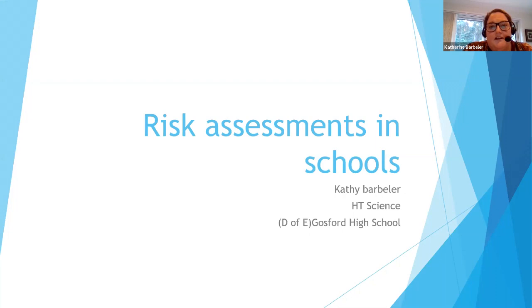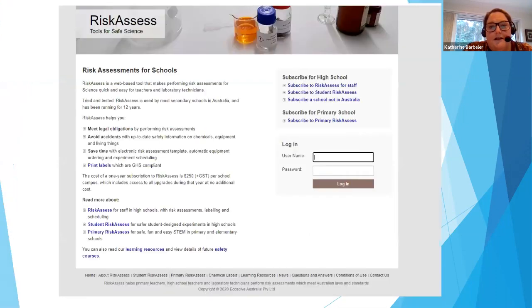My greatest challenge is probably that teachers do the risk assessments on behalf of the students. What's displayed now would be very common in most schools. It's an online risk assessment tool. We all pay annual subscriptions. I can only comment from a departmental view. Annually we pay, I think, $250. That gives us access to this tool.